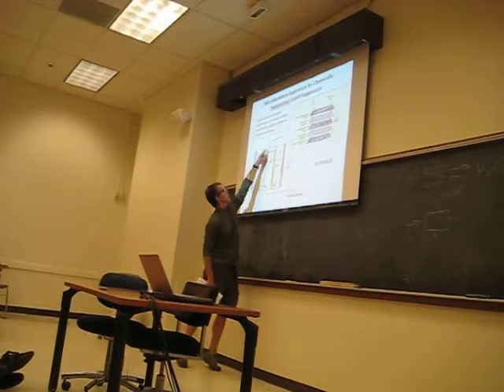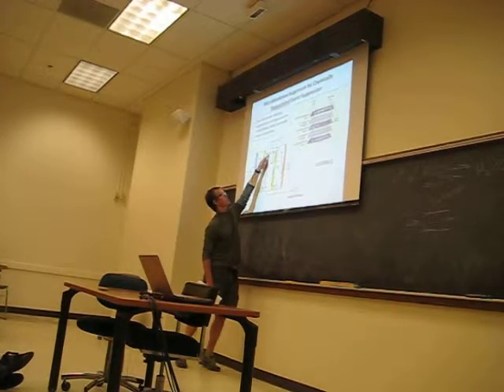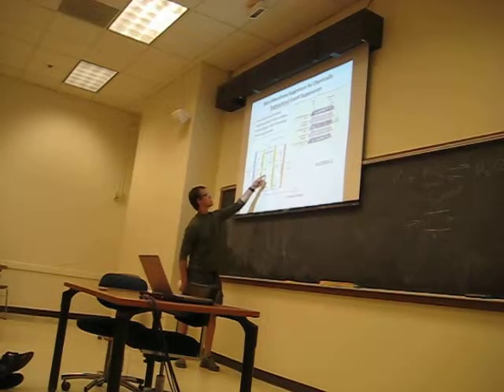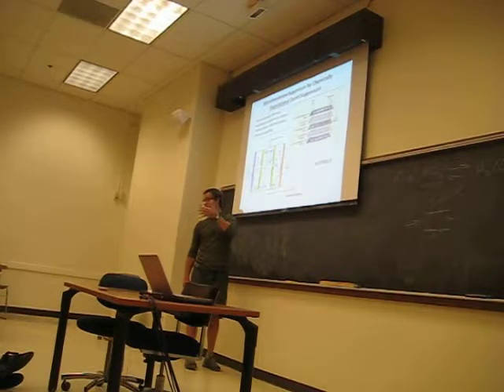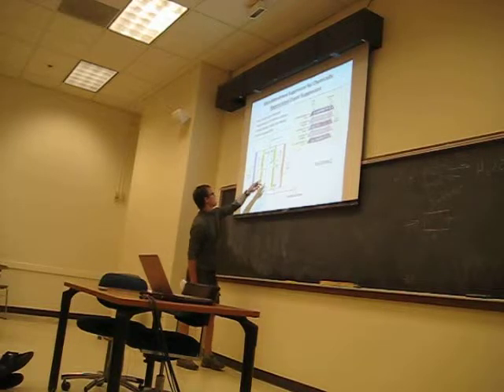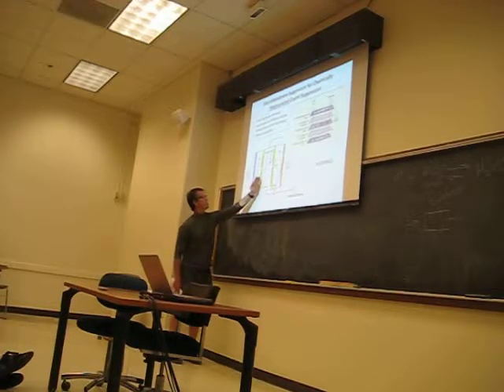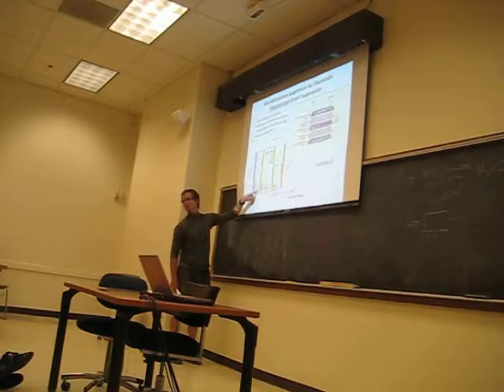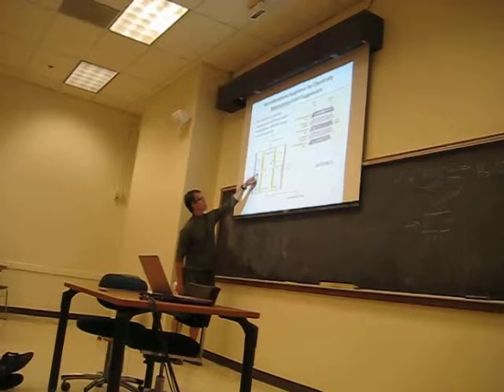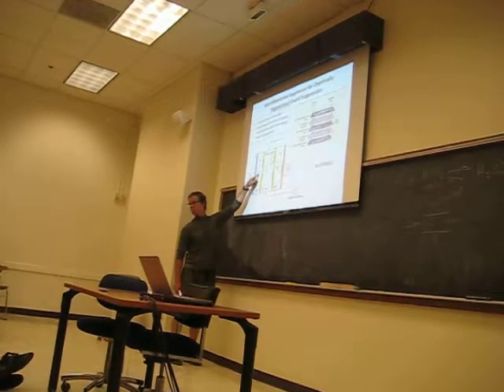Your solution from the column is coming through rich in bicarbonate, as well as the anions you're trying to separate, which aren't shown here. Okay. And you're using a sodium bicarbonate. So you have bicarbonate as well as the cations come in as part of your eluent. Right? On the anode, in this space on this side of the cation exchange membrane, the potential is oxidizing water against this anode and oxidizing the water into oxygen and protons.